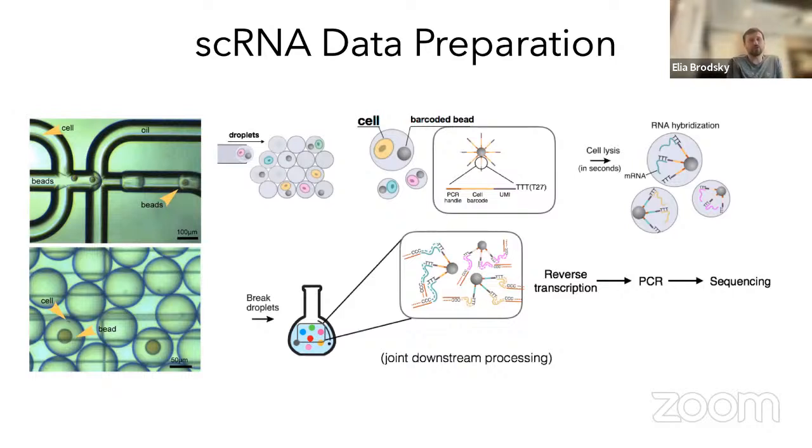If we are going to study something at the single cell level, we need to understand how we differentiate between the many thousands of cells that we potentially have to sequence. And to do that, one of the ideas is to give them a barcode. So if I could generate a barcode for a type of cells, right? I'm not generating a barcode for every individual cell. I'm just assigning them to maybe different tissues or different batches or something like that.